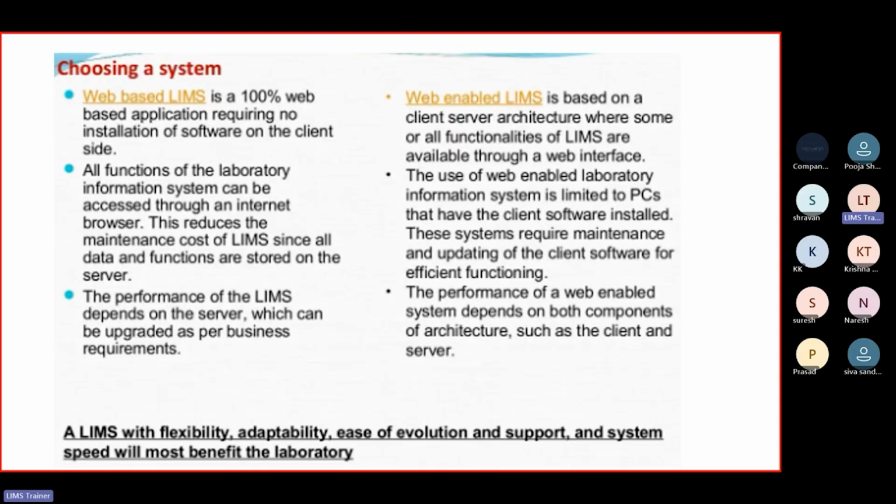It will require only the URL and only a browser, any browser in your system, and by clicking that URL, you can directly open that LIMS software. There is no installation of software required on the client side. So this is called a 100% web-based LIMS.